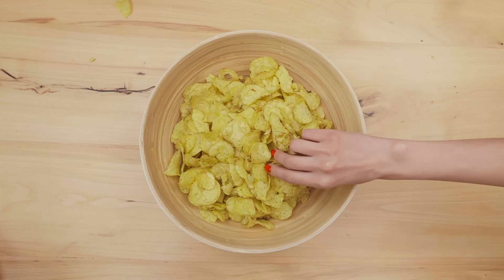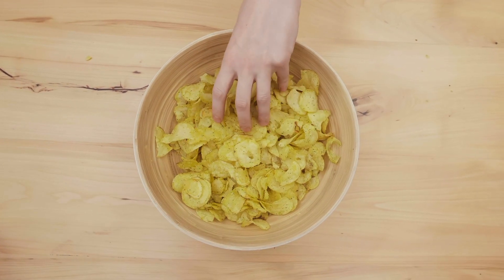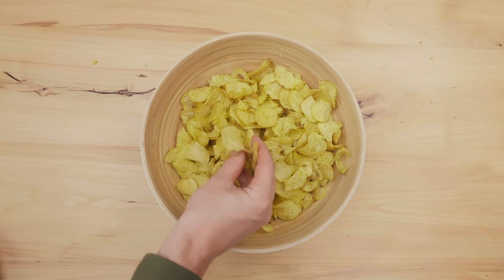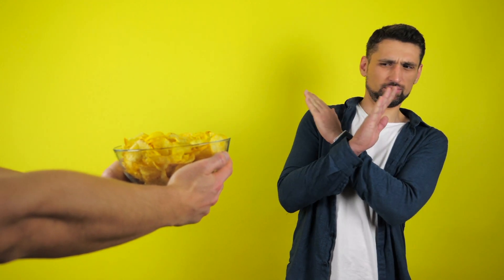Enticing customers, providing a satisfactory eating experience which frankly is based primarily on appearance and taste. And let's face it, if the chips poured out of their container are uneven in appearance color-wise, tasting is out of the question, regardless of flavor.